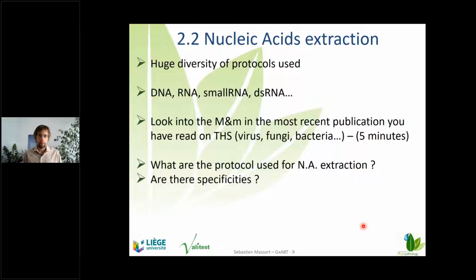So what I will ask you to do now, for just a bit less than 5 minutes, is to look at the most recent publication that you have read on, not THS, but HTS, sorry, whatever it is. It may be yesterday, last week, last month, whatever. Have a look at what the nucleic acid extraction protocol used is. And the key question is whether there are specificities for this single step. So it's easy, you go to material and methods. Usually you have sampling and after that nucleic acid extraction. So have a look there.